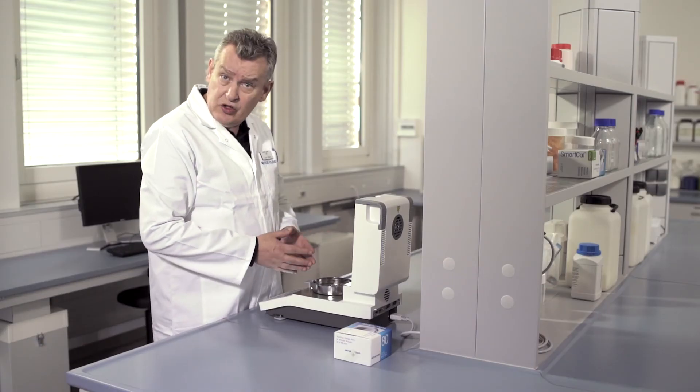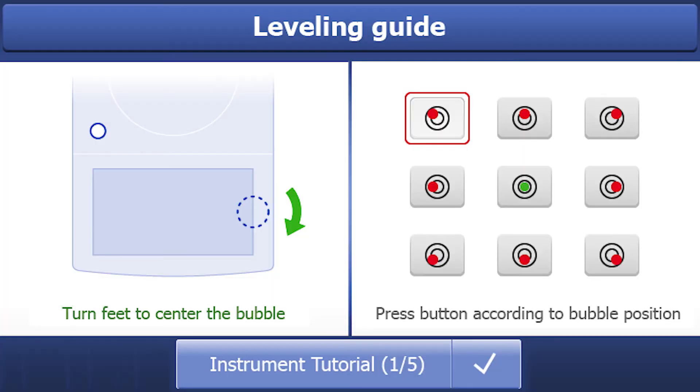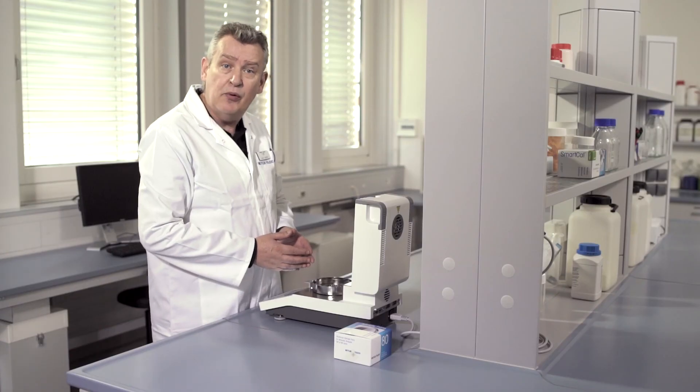The instrument tutorial contains a leveling guidance section which assists you in the leveling process.